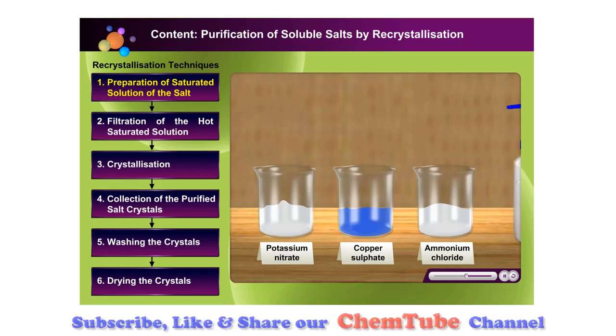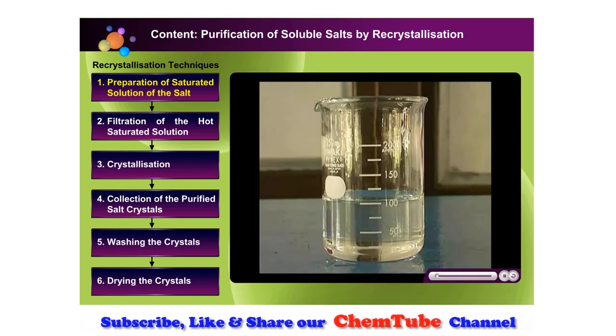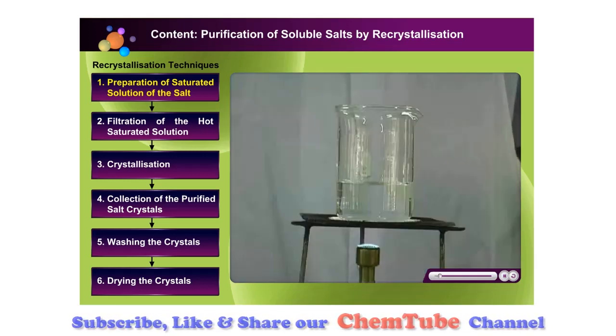We are going to use distilled water as the solvent for the re-crystallisation of these salts. To begin, choose a soluble salt that you would like to use for re-crystallisation. Now, fill a beaker with distilled water and heat it gently.